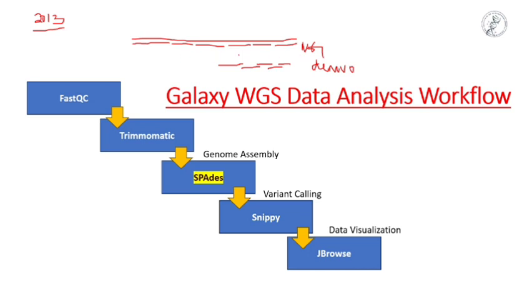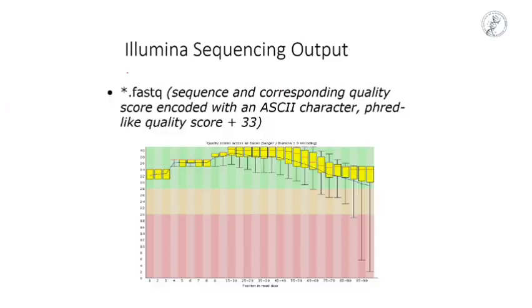When we get the FASTQ sequence, we have the quality score of each nucleotide. Then we also look at the quality score of the whole sequence. That process is done by a tool. I think you know that a lot of tools are there in NCBI: BLAST, different BLASTs like N BLAST, P BLAST, primer BLAST, and then ORF finder, and many other tools.